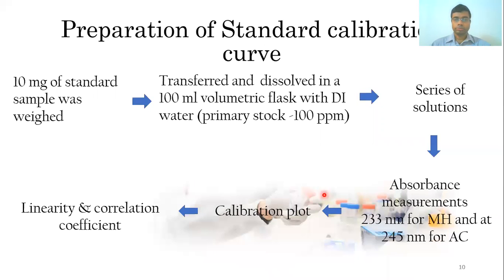Okay, so we have chosen the right solvent for these ones, and for some of the drugs, for some of the samples, we might need to use co-solvents as well. So it depends on the drug. When you are doing the analysis, you will understand whether this is completely soluble. If it is soluble, then we can use it directly. If it is not soluble, then definitely we need to add a certain co-solvent to speed up the solubility or the dissolving process.